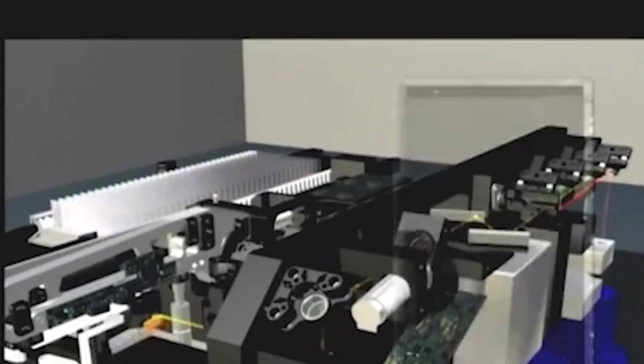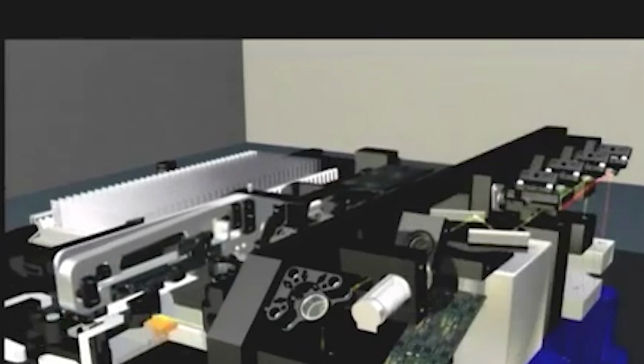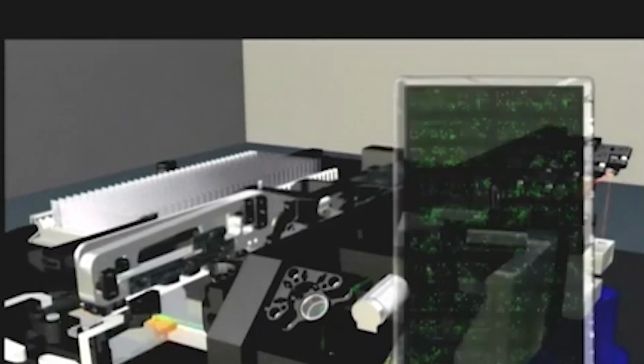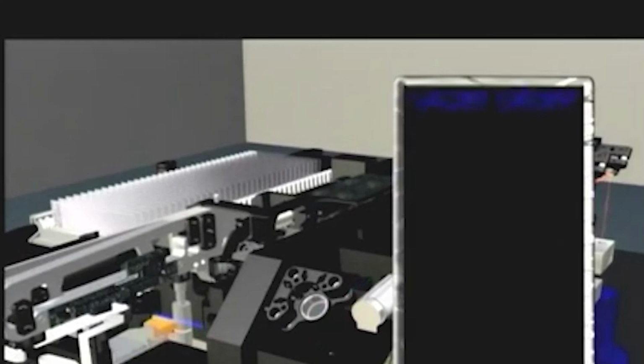Each channel is scanned sequentially, and the developing images are displayed on the monitor. The multi-channel TIFF images are saved automatically, according to file naming conventions specified by the user.